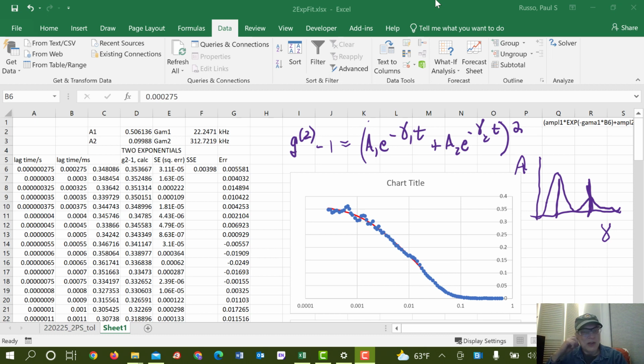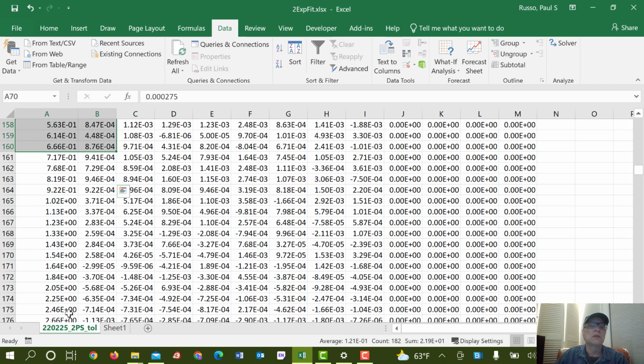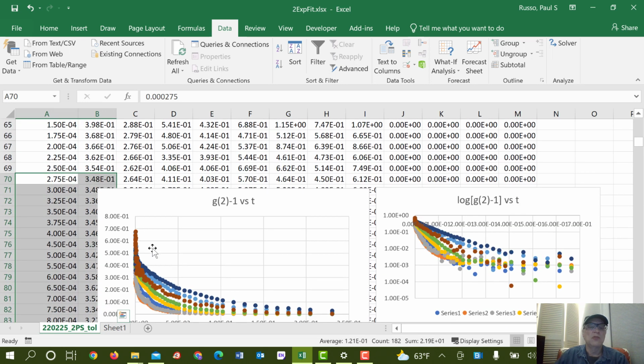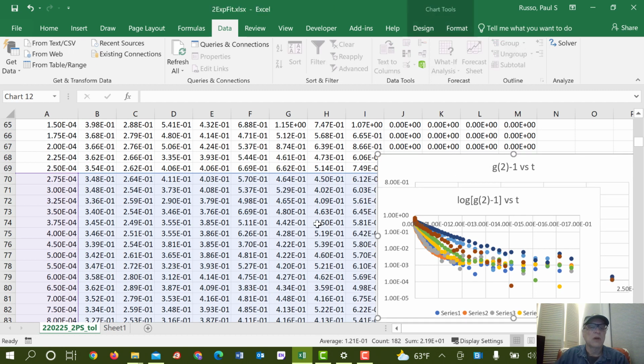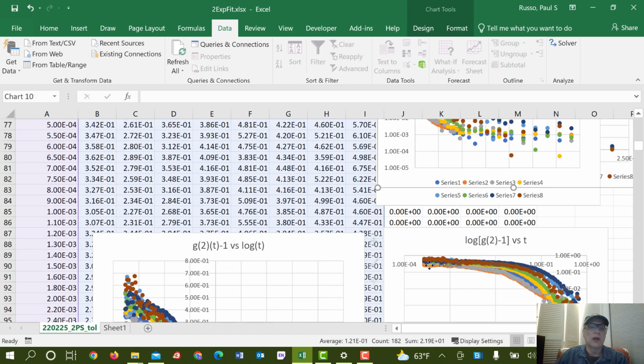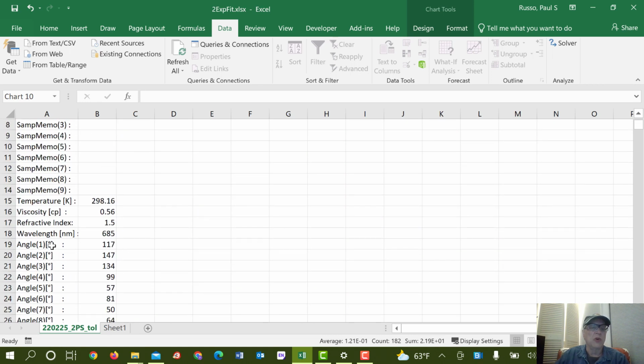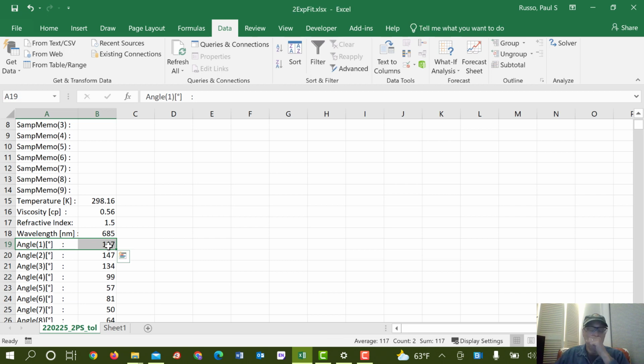Well, now I realize that I didn't actually complete the entire problem, and I don't really know that I need to, but I do just want to show what would happen next. I would go back to here and choose the next column. Okay, so I chose the first column. And remember, they're associated with angles according to what you see up here. So that was the 117 degree angle, one of our higher plots.